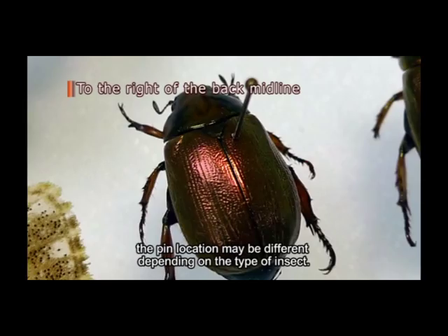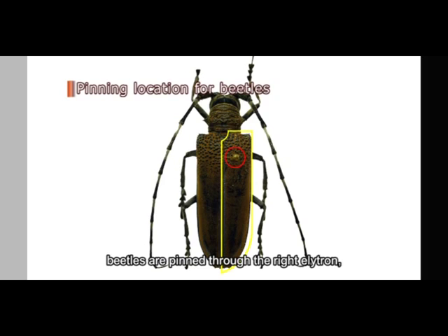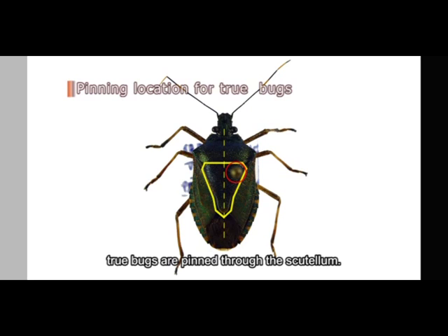Grasp the insect between your thumb and index finger, then press the proper-sized pin vertically through the thorax with the other hand. Insects are usually pinned through the thorax between the bases of the four wings, or slightly to the right of the midline. However, the pin location may be different depending on the type of insect.